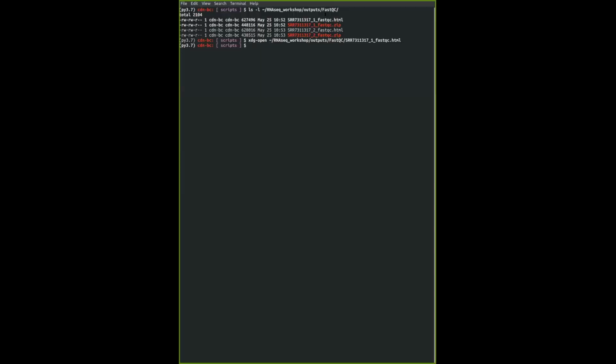There shouldn't be too much coding from now on. It's mainly downloading scripts, because writing this script will take quite a while. So I'm going to provide you with the script. You already have the idea of how to write scripts. So we're now going through a script that I've already written, running it, and then we'll see the output. I guess it's more fun to look at the output rather than troubleshooting the script over and over again.